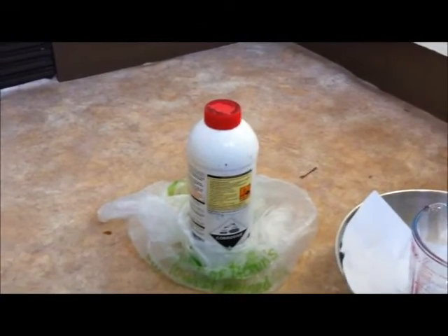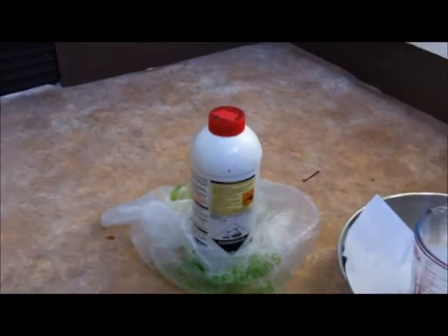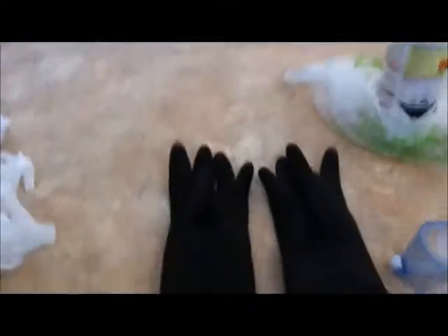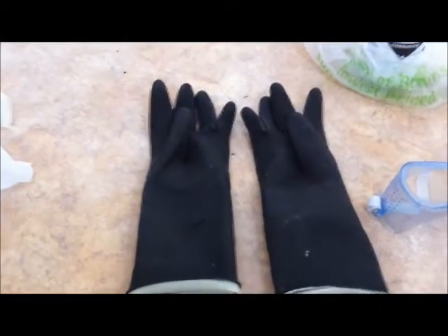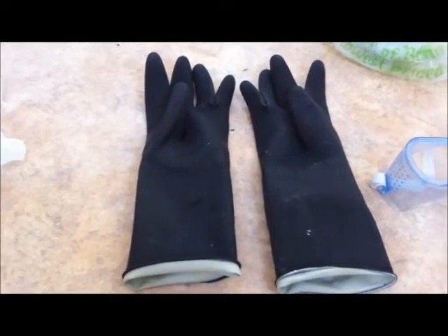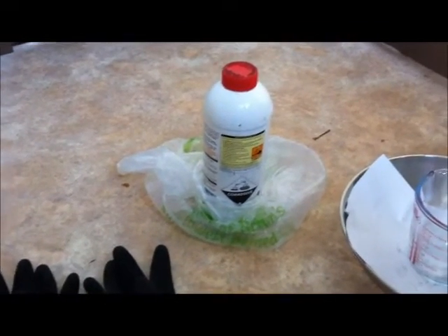What I'm going to do is demonstrate the dangers of using this stuff. If you are going to use this stuff, please do yourself a favour and use protective equipment such as gloves. And when I say gloves, I don't mean cotton gloves or something like that - get yourself some substantial chemical resistant gloves such as these ones here. Because if you spill this stuff on your skin, you're going to be in for a nasty surprise.